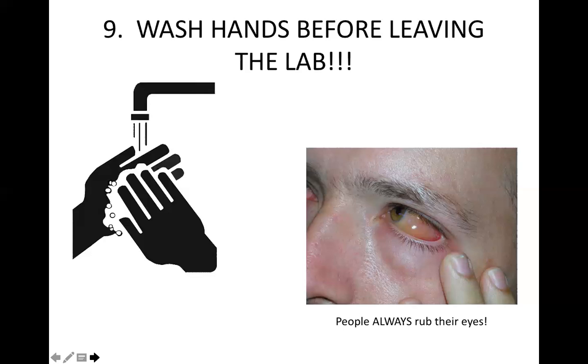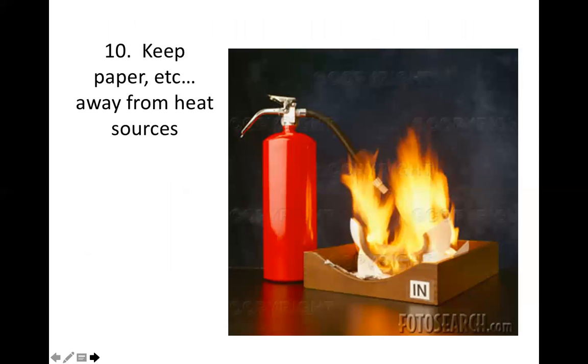Next, keep paper and other flammable objects away from sources of heat. So, like we said, it's very common for a scientist to use fire to heat different kinds of substances to check if there will be a reaction or not.